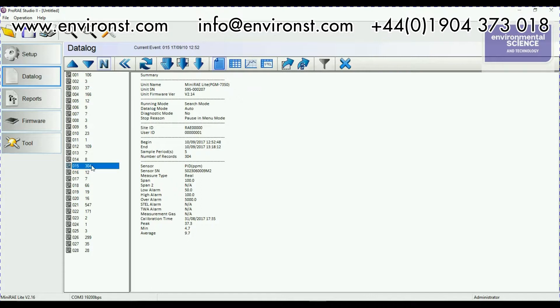If I click it we'll get a quick summary. So I had a peak of 37.3, a minimum of 4.7 and an average of 9.7.